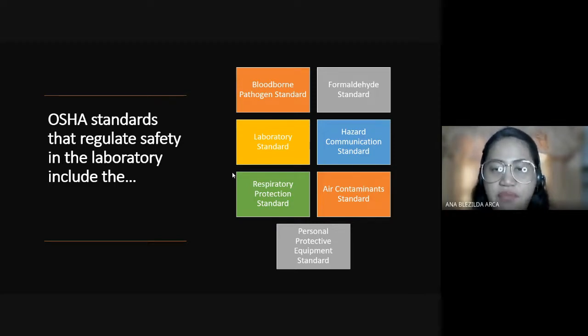And of course, respiratory protection standard. What are the difference? Ito yung mga standard different procedures na kailangan to avoid getting infected via aerosols or respiratory droplets. Okay? So lahat daw ng sneezing-hot mo, possible na ma-infect ka dyan. Kaya nga naman, mayroong mga standard practices to avoid that. Ano bang example ng respiratory protection standard na we practice in the laboratory?